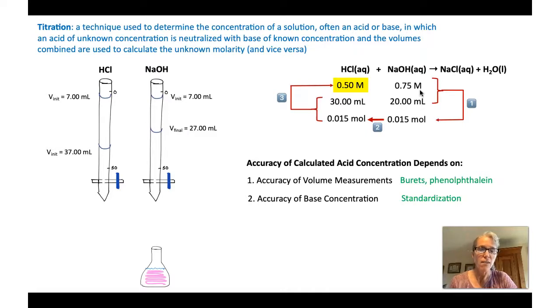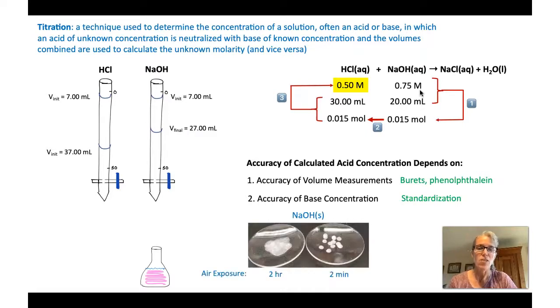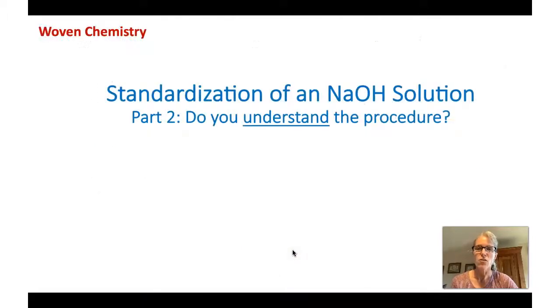And we have to standardize it because sodium hydroxide is hygroscopic. It absorbs water out of the air. So we don't know precisely how many grams of sodium hydroxide we have in a solution. So we're not going to know its concentration accurately unless we standardize it. So there you go. There's the what and the why of titration and standardization.